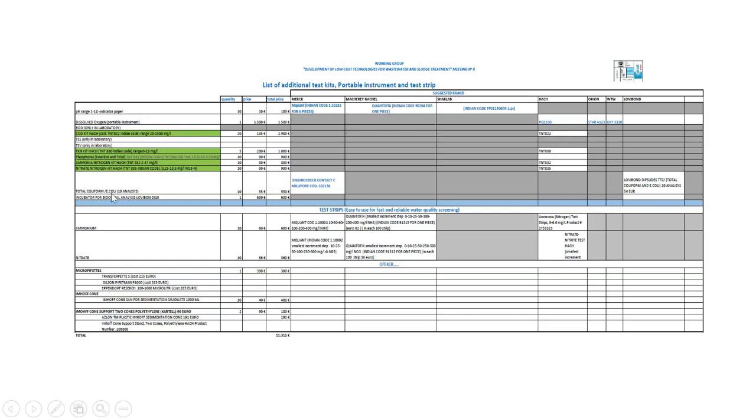After that, it's possible to make analysis about bacteria, total coliform and E. coli, but it is necessary to buy an incubator. So these are the 2 brands that make analysis about total coliform and E. coli: Merck and Lovibond.